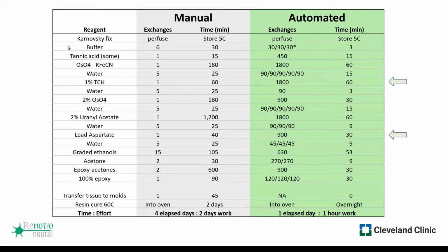So here we just rinse many times in cacodylate buffer to remove any aldehydes and phosphate before going into the reduced osmium, which is chilled, and then we put it in just before we need to use it. After the water rinses were complete, at this point I had the ASP 1000 send me a text and also do what it calls an aspirate and hold, where it aspirates liquid from the well and just holds that in the capsules, so that they stay wet.